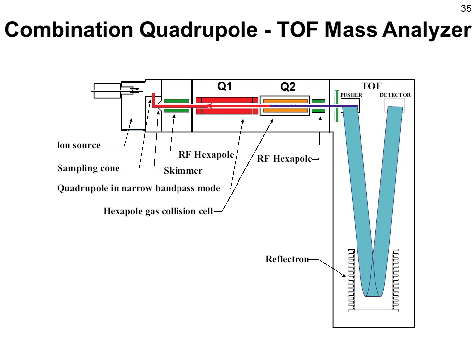Different mass analyzers can be combined in so-called hybrid instruments. Here we see a very common combination of a quadrupole mass analyzer and a time of flight mass analyzer. You may ask, how is this possible? The quadrupole mass analyzer works in this case with an electrospray ionization source. On the left side you may imagine the HPLC system. This is a source that generates ions continuously, while the time of flight mass analyzer requires ion packages to measure their time of flight. Let's see how this combination is brought about.